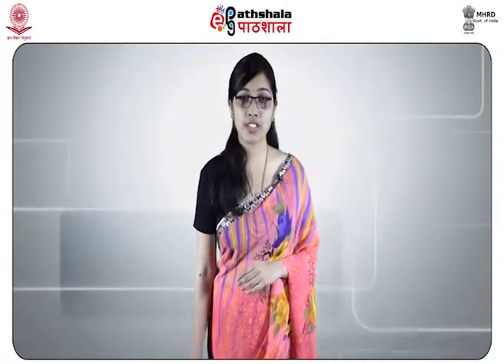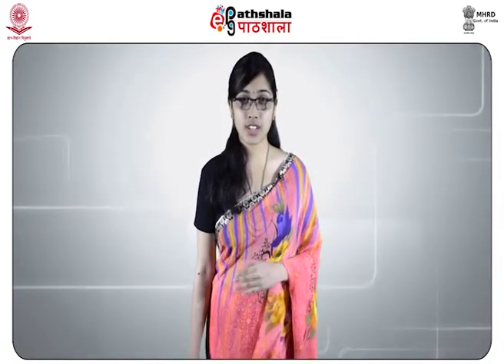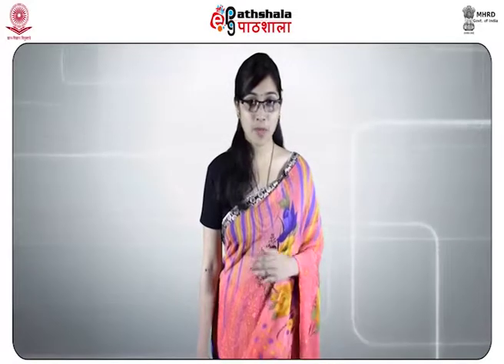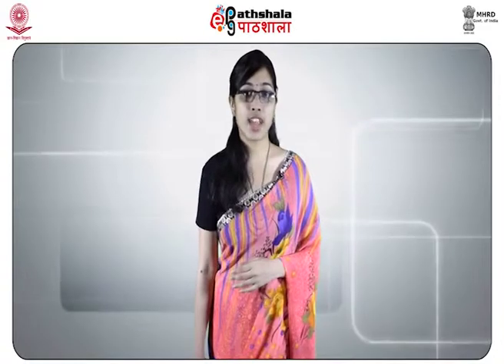Light microscopy is used for the examination of human hairs in forensic laboratories. Microscopic examination is conducted so as to analyze whether two or more individuals came in contact, or a person came in contact with an object. Two compound light microscopes are connected by an optical bridge in comparison microscopes, which helps in the simultaneous viewing of the questioned and the known hairs. The range of magnification commonly used is approximately 40x to 400x.